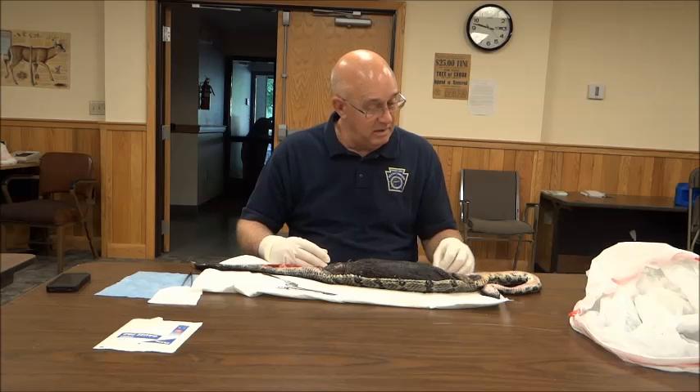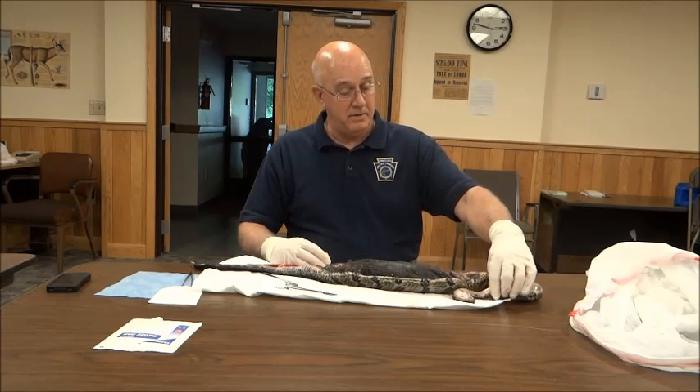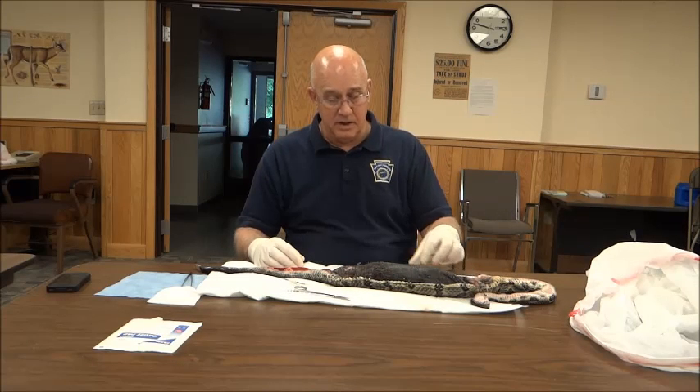It stretched thin. I just wonder how often that happens — if they eat prey that's just too big for them. That was the question.